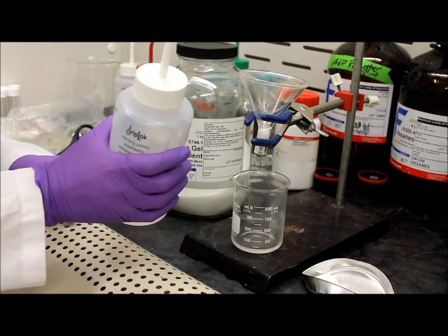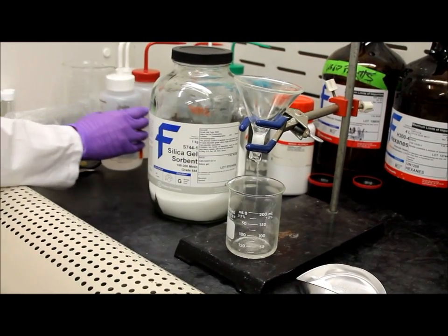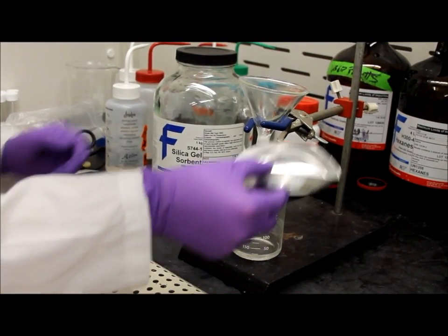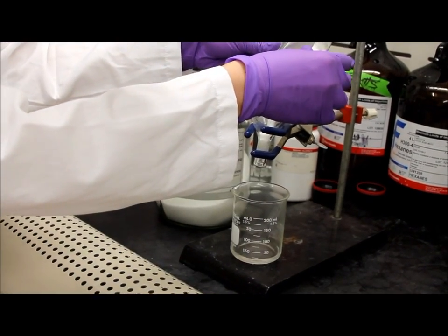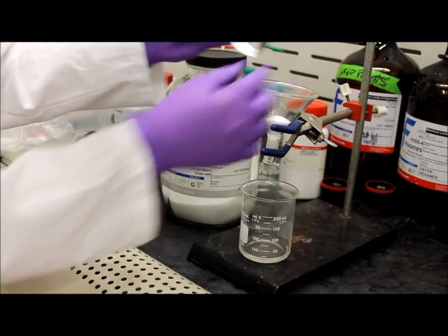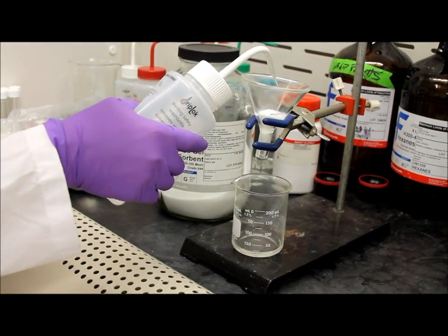Condition your glass wool with a little bit of hexane. Once that is done, pour your silica gel on top of the glass wool and condition your silica gel with a little bit of hexane again.